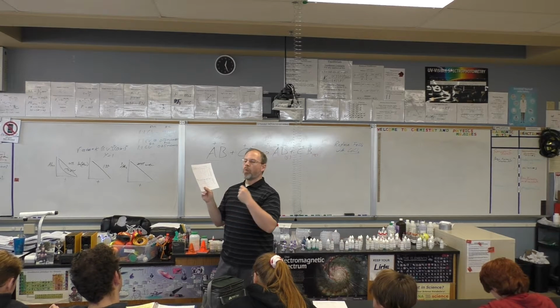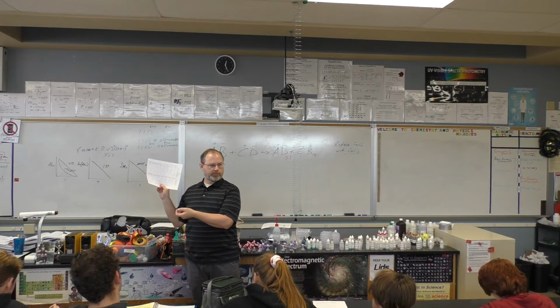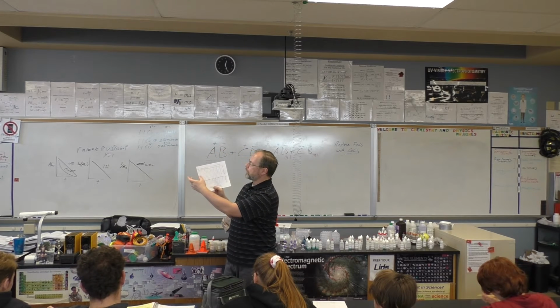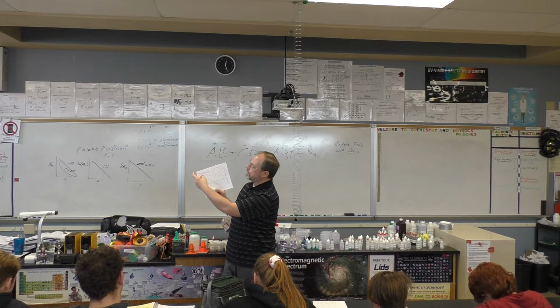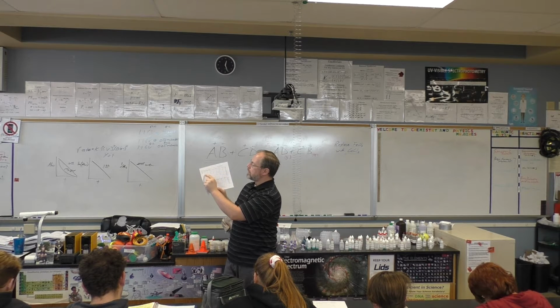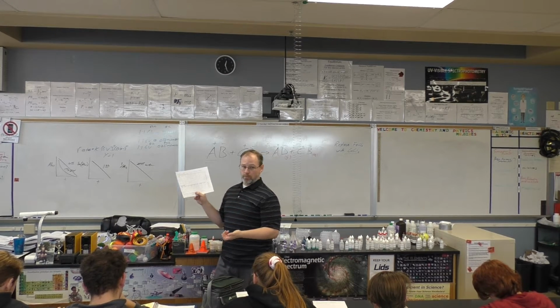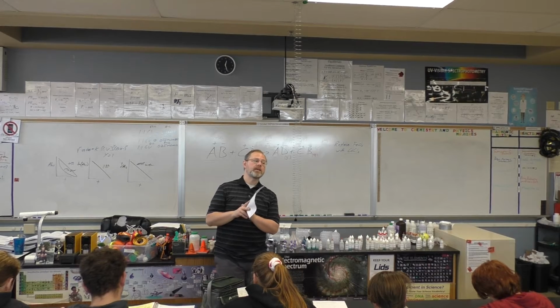So in this second box, we're going to be spending quite a lot of time. You're going to determine what the products are. They're all going to swap partners. What are the products going to be? So, for instance, in this next one, silver nitrate and calcium chloride, you're going to make silver chloride and calcium nitrate. Make sense?